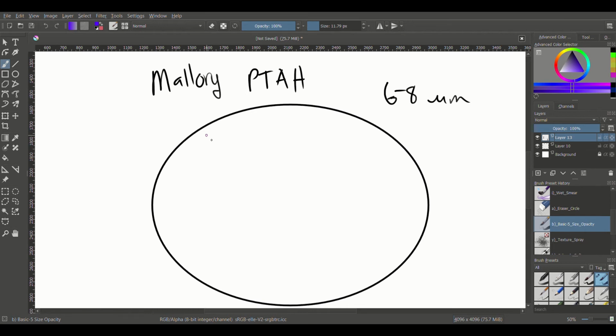And so if there's any kind of hematin around, it makes a blue lake. And that makes the blue color for the glia and some of the myelin. And that's where one of the limitations of this stain comes up, is that the myelin and the glia can be the same color, so they're hard to differentiate. But the neurons, so the cell bodies, are going to be kind of a salmon color.